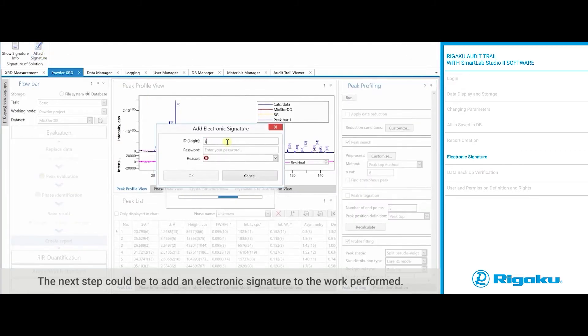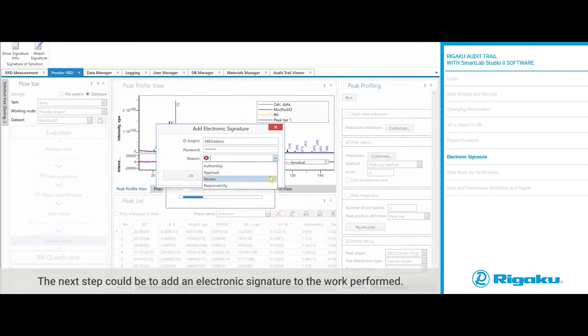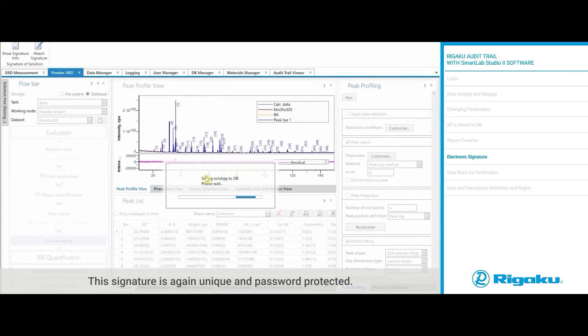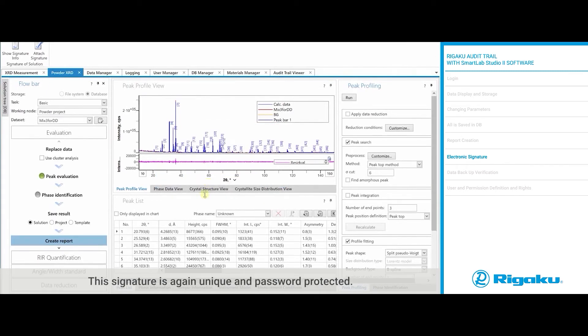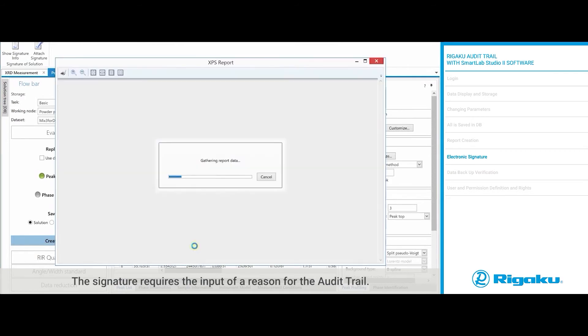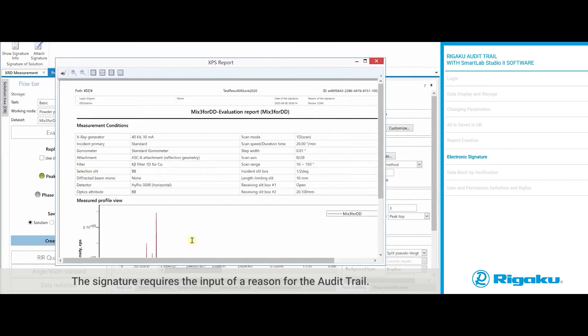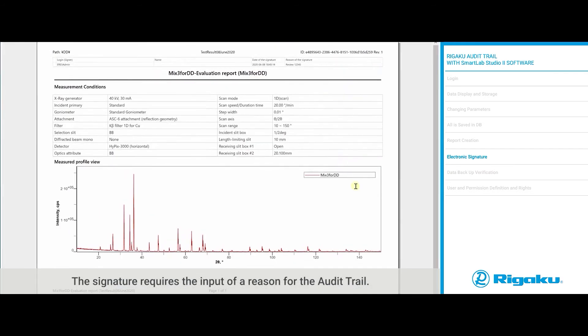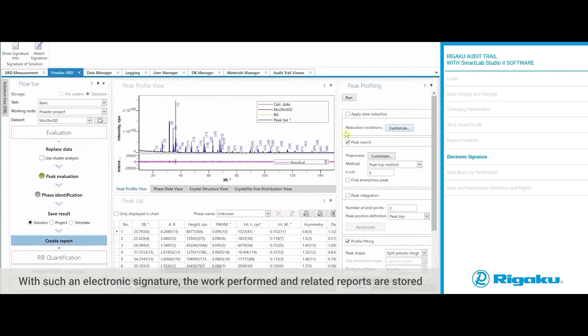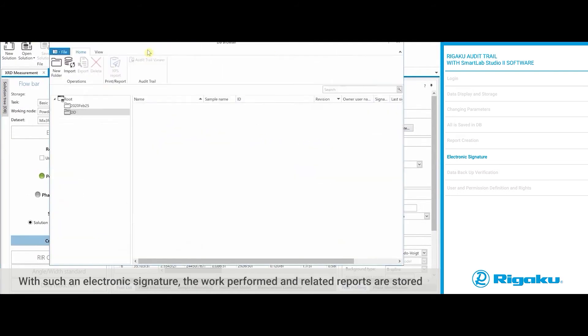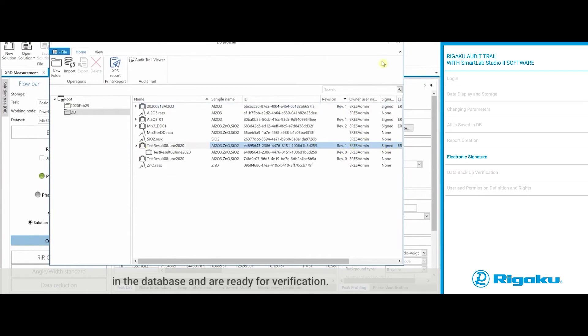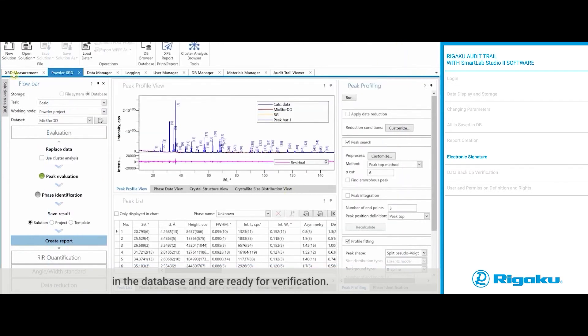The next step could be to add an electronic signature to the work performed. This signature is again unique and password protected. The signature requires the input of a reason for the audit trail. With such an electronic signature, the work performed and related reports are stored in the database and are ready for verification.